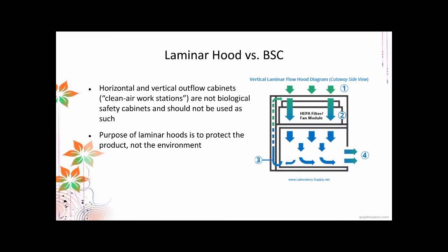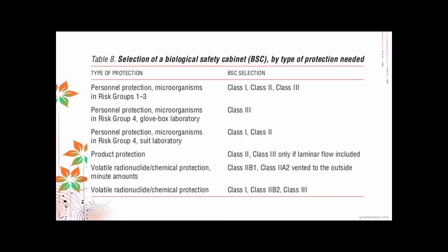So a laminar hood must not be used in handling pathogenic substances, because you are just directing the pathogens outside. The flow of air is towards the personnel. If the thing you are handling here is infectious, your personnel will be infected, because the direction of the air is towards the personnel.